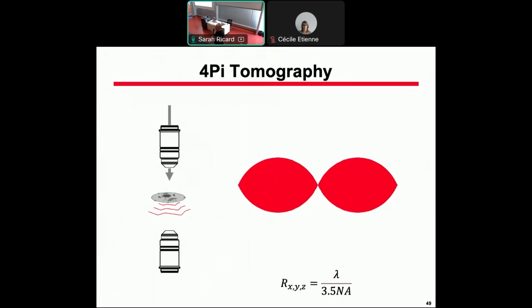And that is easy for astronomy because there is lots of money. Not so easy here. But in tomography, it should be much easier. One, because we are making holography, we are using lasers, so we have the coherence. So the trick is, if we illuminate through this objective, that's a regular transmission tomography. Now, we are able to detect what is back reflected. We have a reflection tomography. And we will add this part in the spectrum.